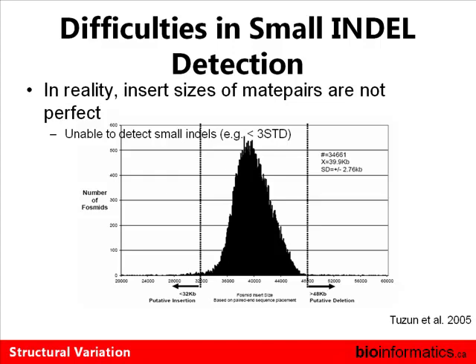People sometimes pretend that distributions of insert sizes are Gaussian. That's not true, pretty much. I haven't seen one which is Gaussian. I've seen some which look absolutely horrible, which have really fat tails and look more or less uniform, up until they slowly drop off. But I've never seen anything which even remotely resembles a Gaussian. This is as close to Gaussian as you'll get.